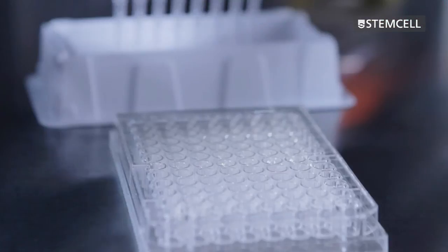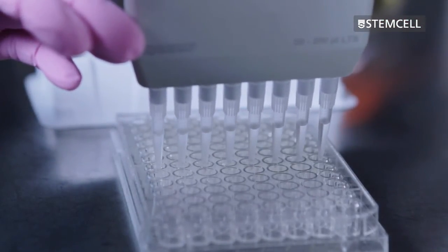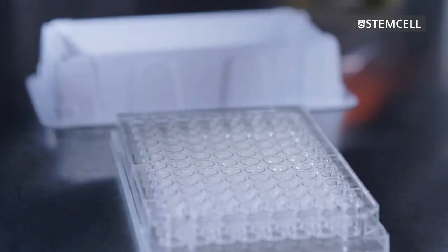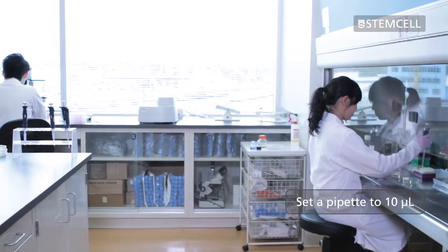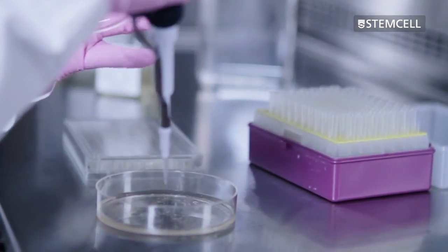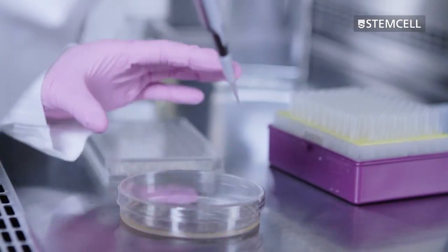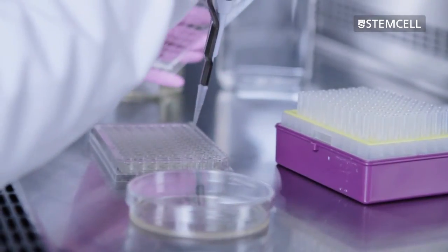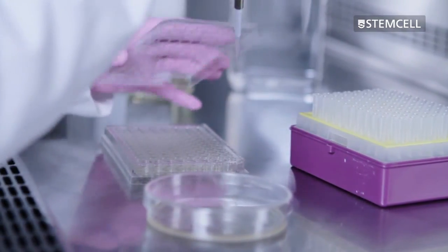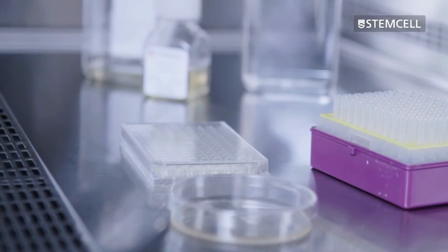Ensure the liquid culture medium contains any additives needed for growth and expansion of your transfected cells. Set a pipette to 10 microlitres. Using a new sterile pipette tip for each colony, aspirate the colonies individually and transfer each colony to the liquid medium in a new well of a 96-well plate. Colonies of different sizes should be selected, as slower growing clones may produce high levels of the desired product.